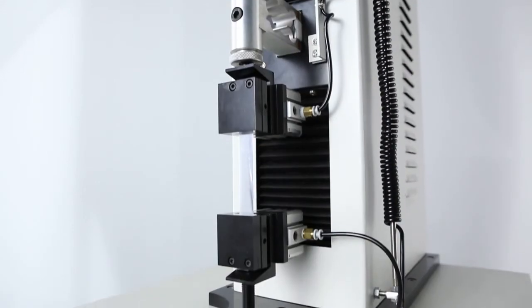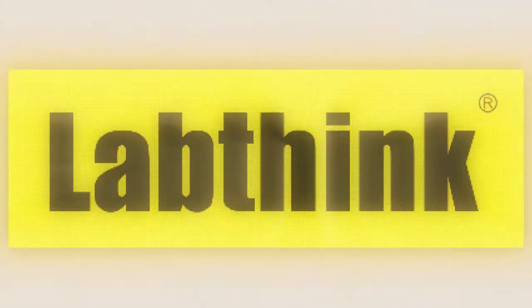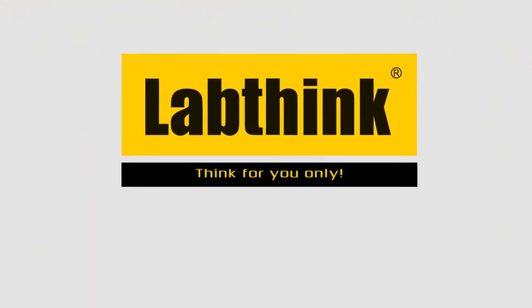XLWM, a great entry model of automatic tensile testers. LabThink. Think for you only.